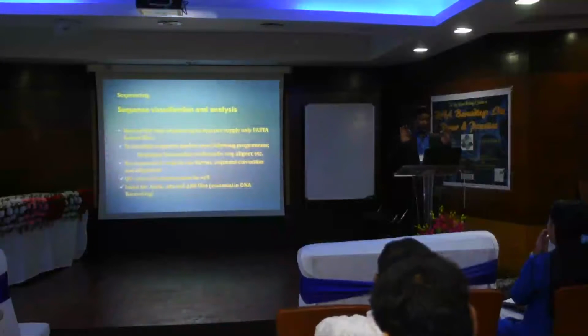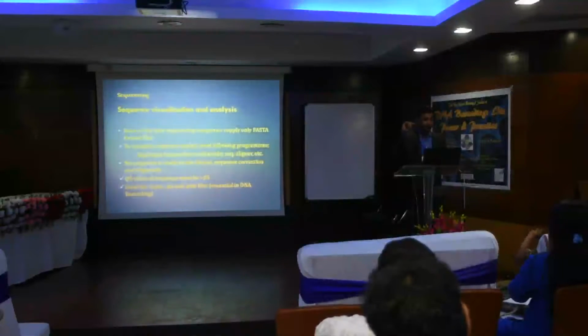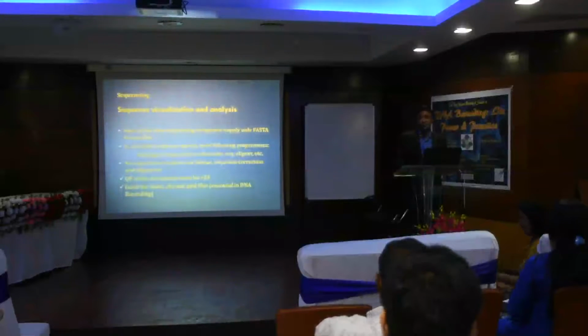No, centrifugation should be refrigerated only, because when you centrifuge at high speed, a lot of friction happens. If you don't have a centrifuge machine with refrigeration, your sample may warm up to more than 50 degrees, and it will cut down all your DNA. Cut down means it will disintegrate your DNA. So in all these protocols, yes, good question, I forgot to tell you.